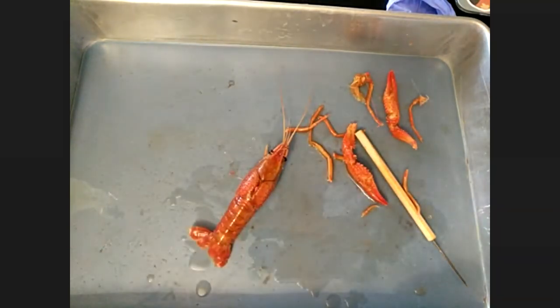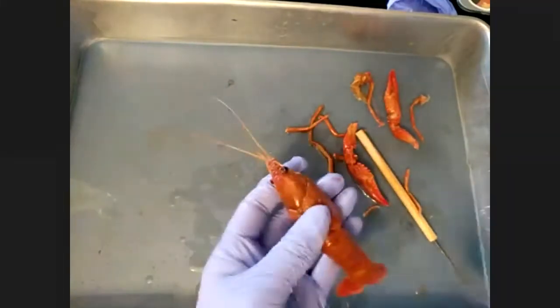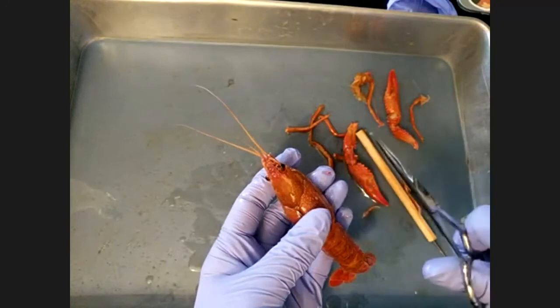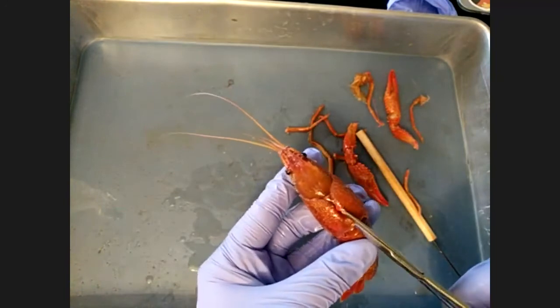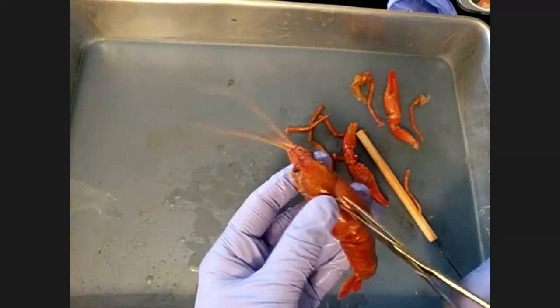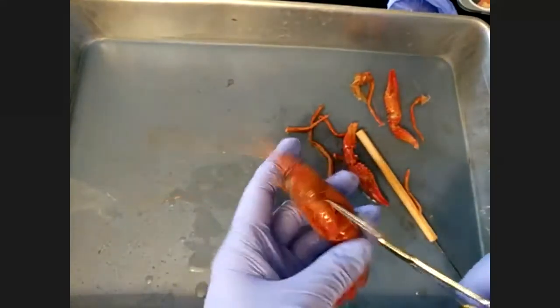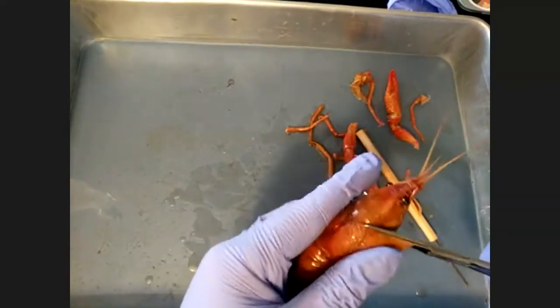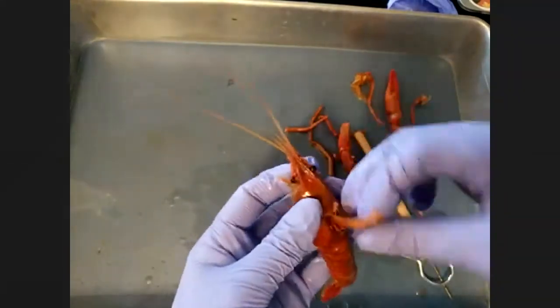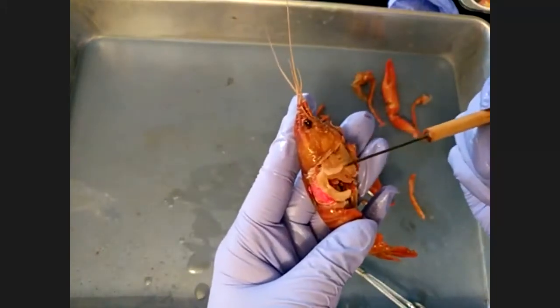All right, the first thing I'm going to do is cut open the middle section right here to expose the gills. Like I said, I have to use scissors because the exoskeleton is too hard to get through with a scalpel. I always do an incision across the back, and then I go up the side right here, right underneath the eye. And what we have exposed right here are the gills.